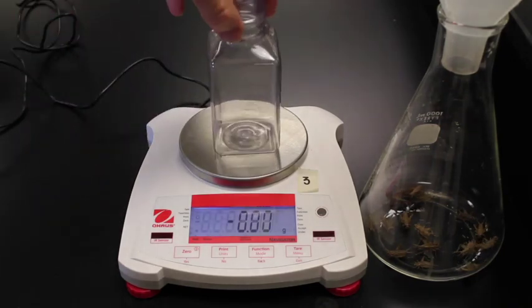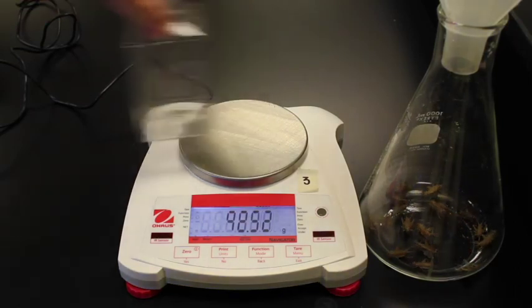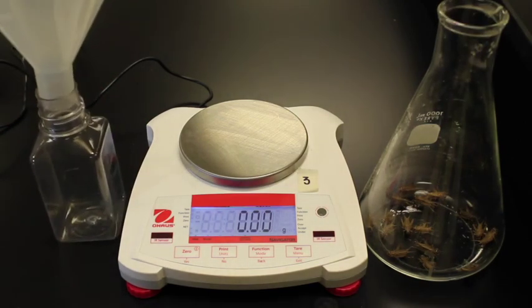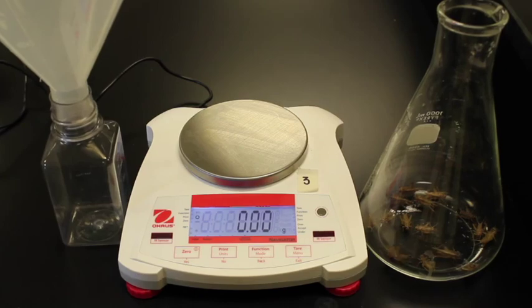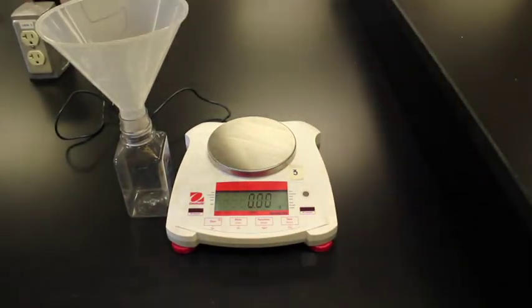So to begin with, we're going to get the mass of this container. So you can go ahead and write down that value for the container. Now I'm going to take the container over here. We will put on the funnel right there. And I'm going to grab the crickets.